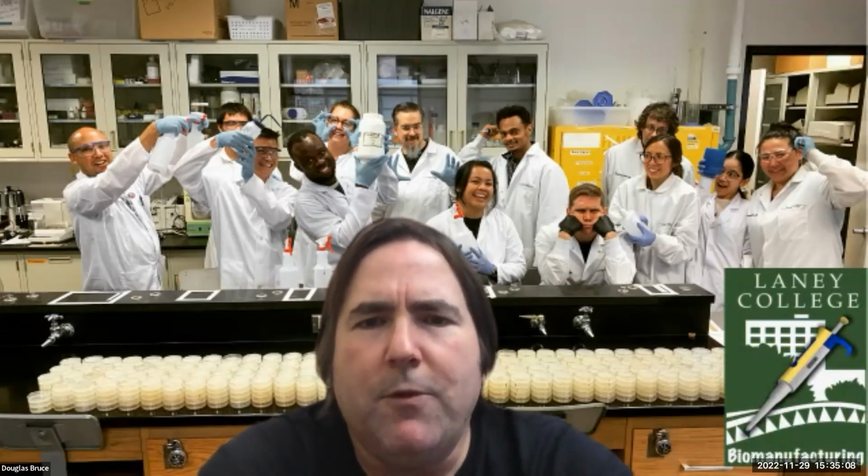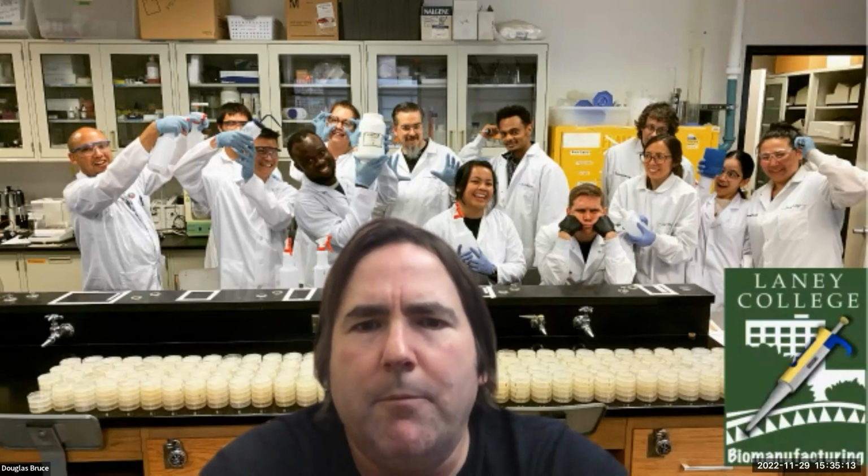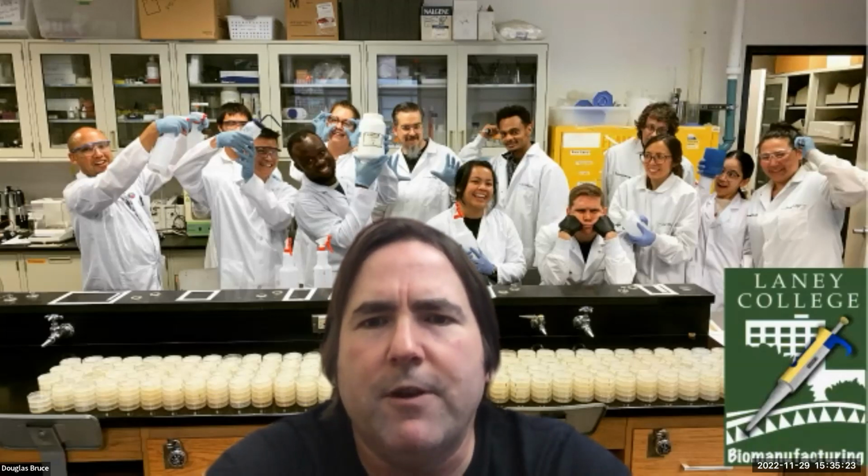And one other question I had was about, you talked a little bit about diafiltration in different scenarios. And another term I've heard a lot in industry is when they're doing what's called a buffer exchange. And I assume that's pretty similar, except instead of using DI, would you just use the replacement buffer in a diafiltration? Yeah, you would just use the buffer. Because RO water or DI water is not always compatible with products, so you're going to want to use whatever they use for a buffer solution in that situation.